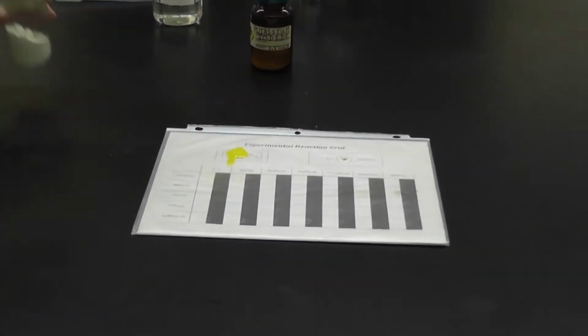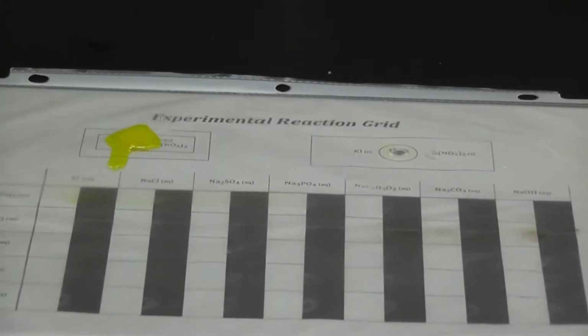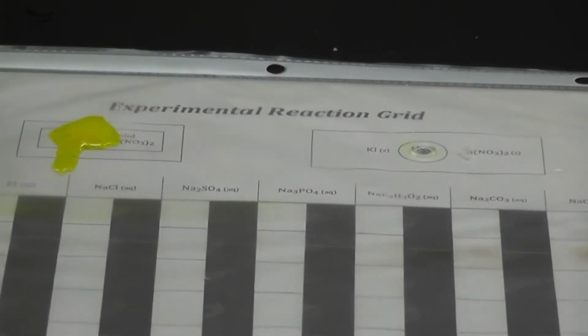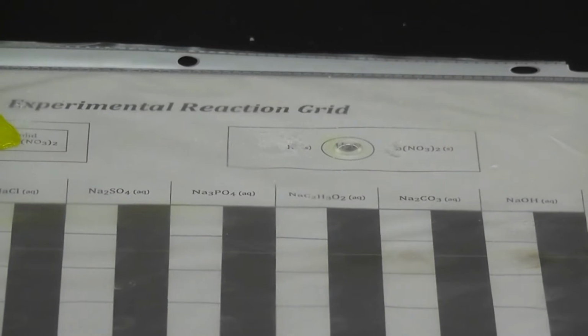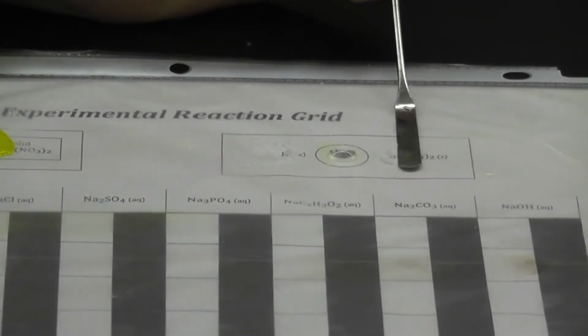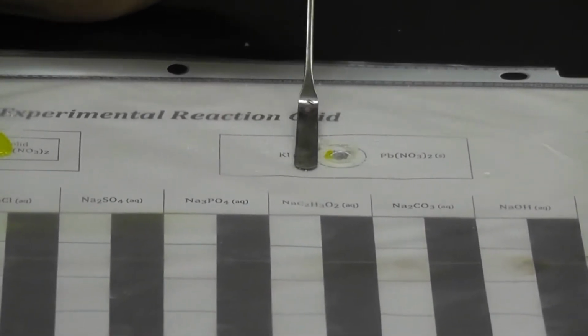And then we're going to add some potassium iodide on the other side. But remember, not in it, just next to it. Okay, so next to it. So now we're going to first push in the lead-2 nitrate into the side of the puddle. It's going to absorb there. Now we're going to push in the potassium iodide and see what happens.